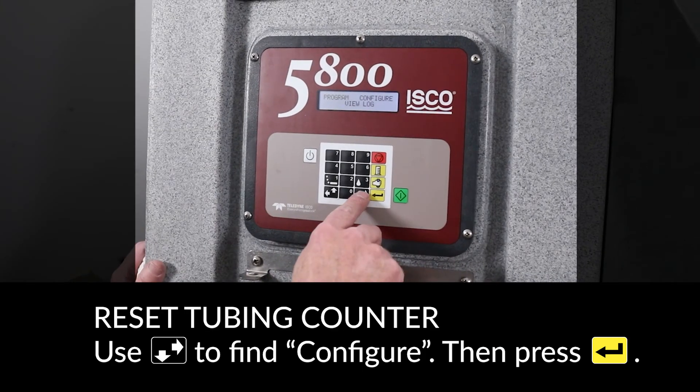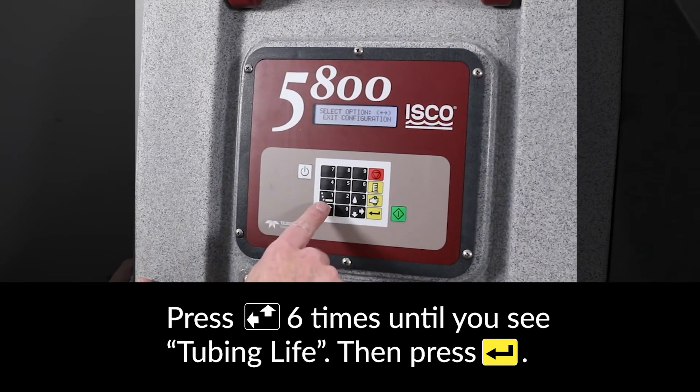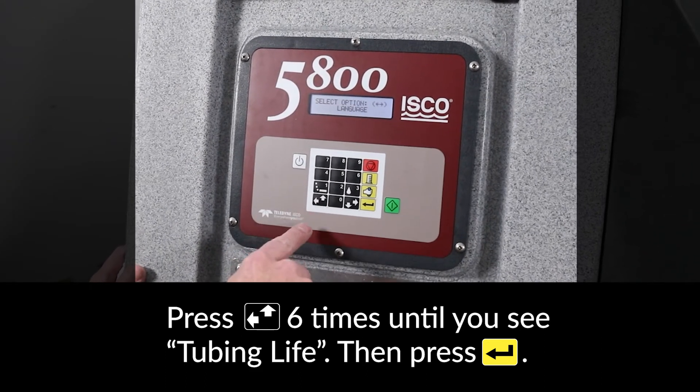To reset the pump tubing counter, arrow over to Configure and press ENTER. Press the left arrow key 6 times until you see Tubing Life and press ENTER.